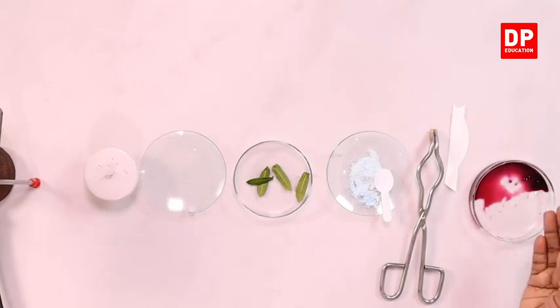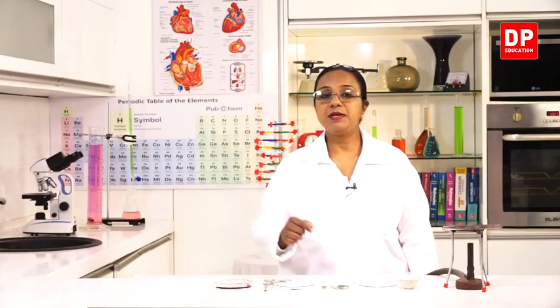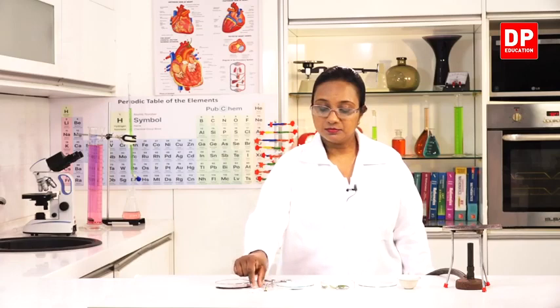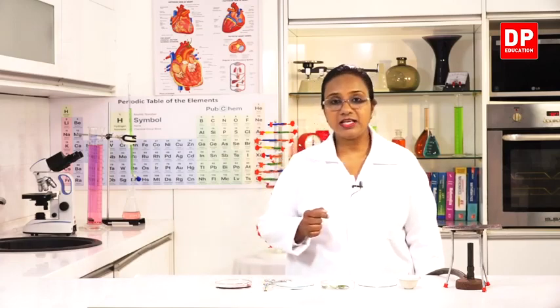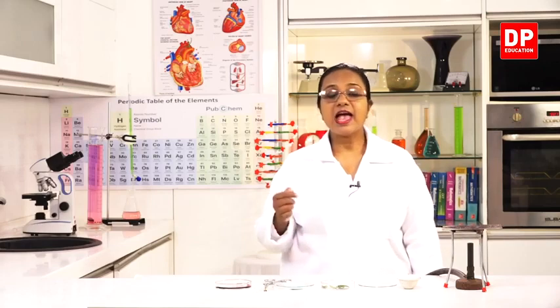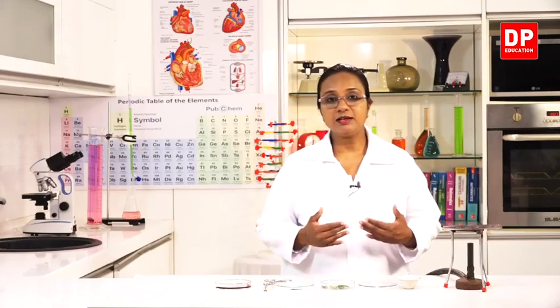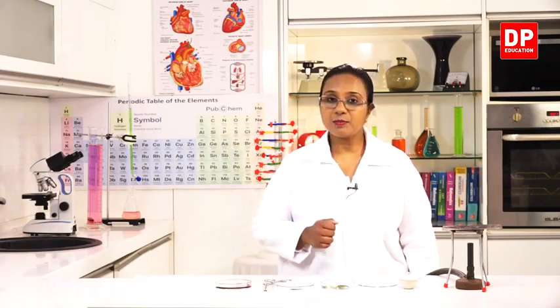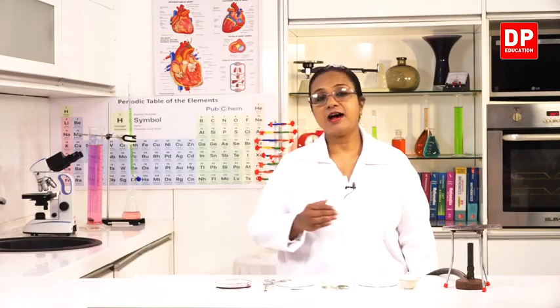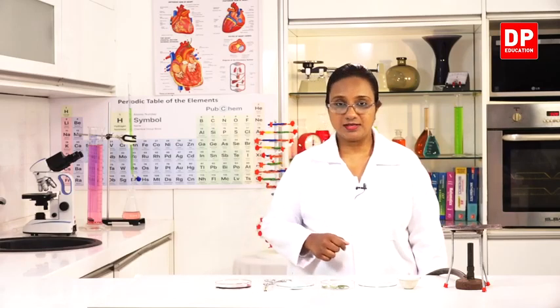Also we have the pink cobalt chloride solution, but we will have to dip a piece of filter paper in cobalt chloride, and then I will heat it so that it becomes anhydrous cobalt chloride, which is blue in color. So, the reagents here are anhydrous copper sulfate and anhydrous cobalt chloride that will be made from this.